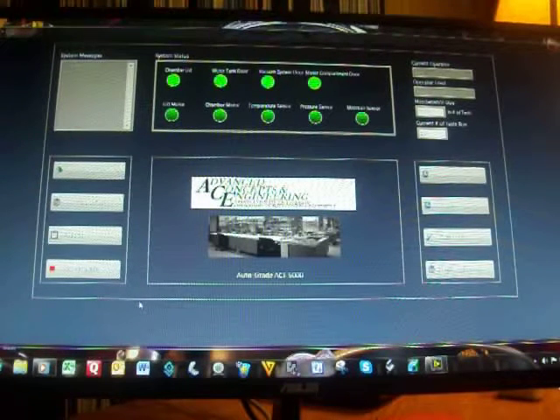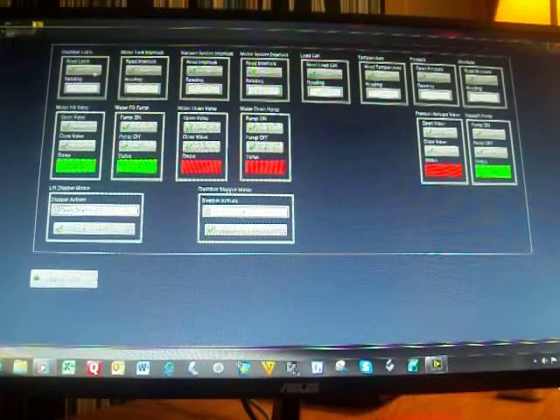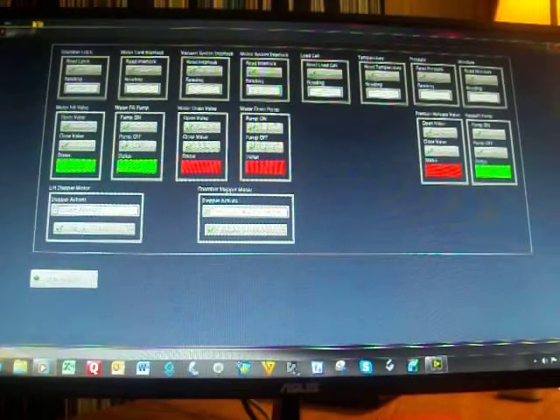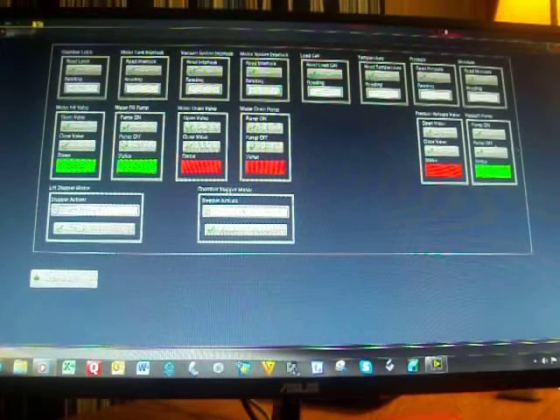There's a technician mode so that a technician with the right login can troubleshoot the system, and that will be over here. And he can do things like, let's read the latch into lock and it's reading good. Let's turn on a water valve, let's close the water valve. Let's turn on a pump, close a pump. Let's tell the stepper motor to move to position number 4. And we get feedback that says it has moved to position number 4. You can use any of the hardware in the system. You can test out from this page.